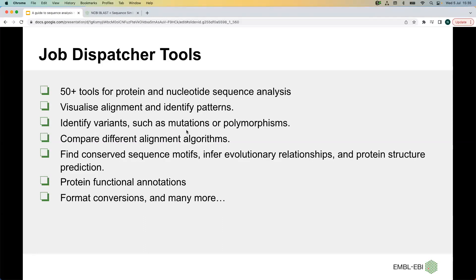We also have several protein functional tools for finding functional annotations, where you search against a range of protein signature databases to identify protein families, domains, and functional sites. Job Dispatcher tools like Clustal Omega, BLAST, etc. are used by other teams within the EBI like UniProt, Ensembl Genomes, etc. So we have users within the EBI itself, and the Job Dispatcher tools can be used in a variety of fundamental research areas.